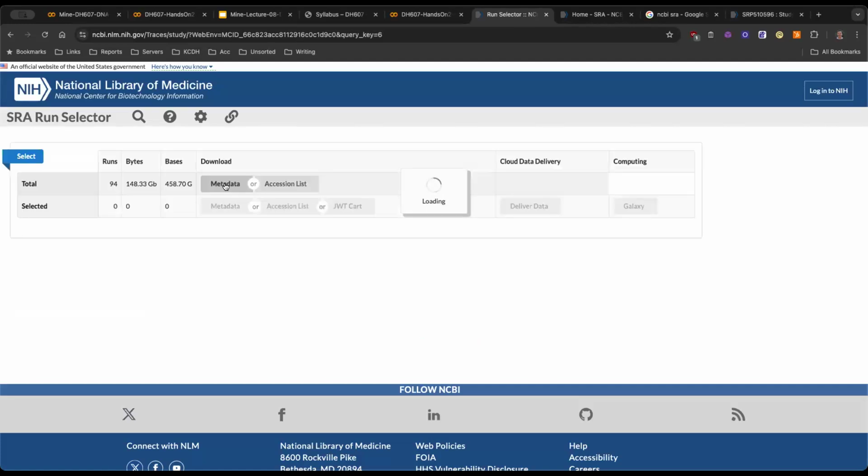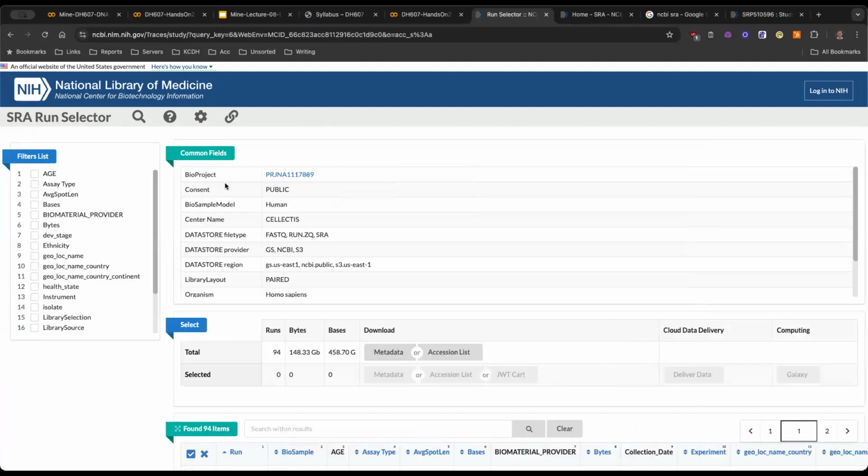When I started working in this area, this was for me the most frustrating part, and it still remains the most frustrating part. I want to just see what data I have access to, and it just keeps on loading, and it will take another 15 seconds more to fetch. I just want to get an idea of what data set I'm looking at.